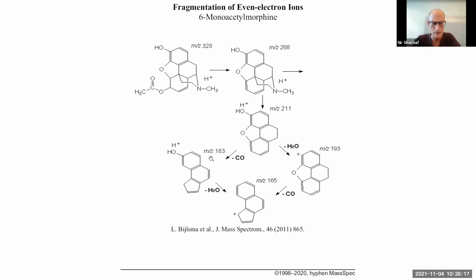Okay, the other question I have is that we work extensively with DIA, and obviously we get a lot of fragments that we cannot explain in the spectra. Also in this case, you left some fragments unaccounted for. Do you have some kind of estimation about the percentage of explained spectra upon which we can be sure that we somehow interpreted the right structure? Not even to the last detail, but at least get.